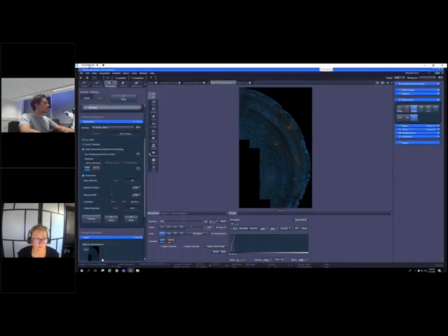So what the deblurring is doing is basically calculating 2 additional planes. The deblurring works on Z-stacks as well as on single plane acquisitions. And what the algorithm is doing, and we are very clear in that, to really tell you what the algorithm is doing in the background, is calculating 2 different additional planes which are convolved from the original image.